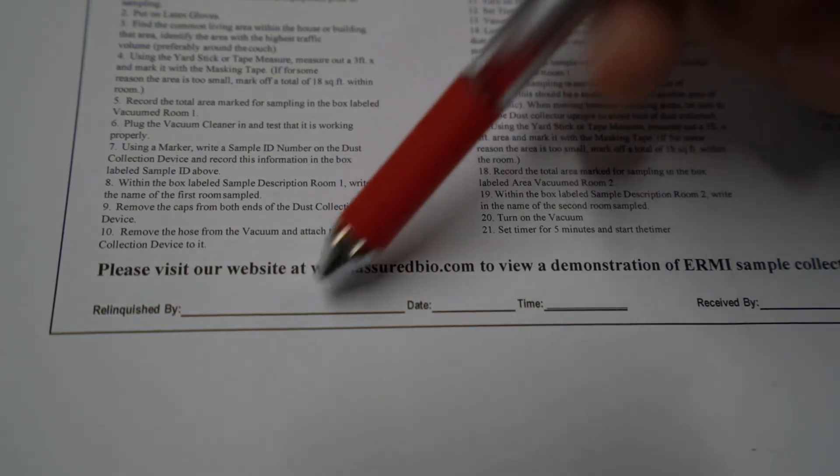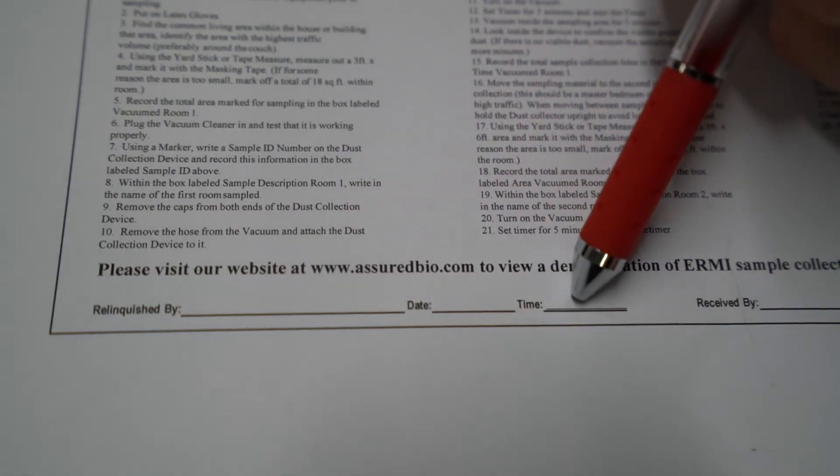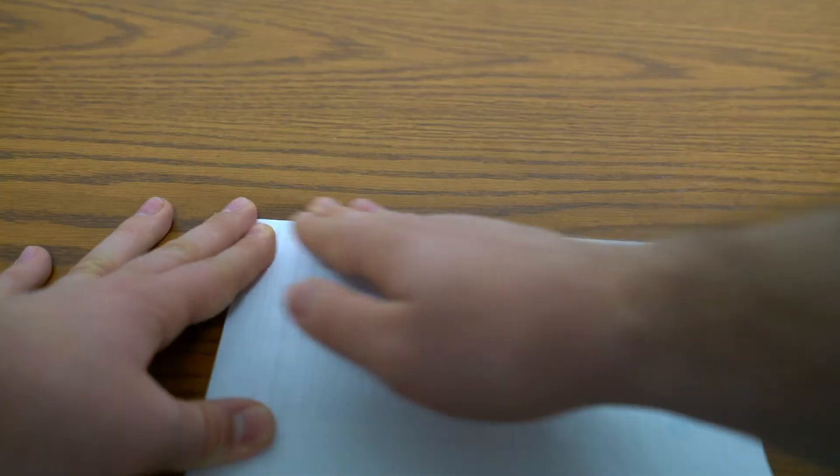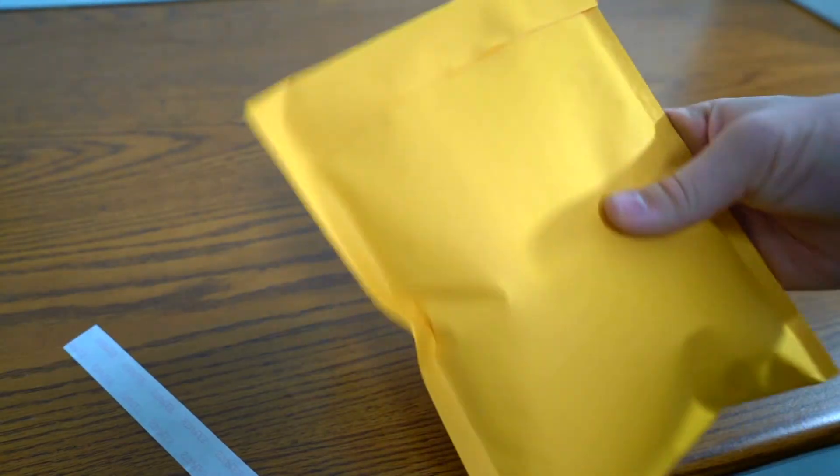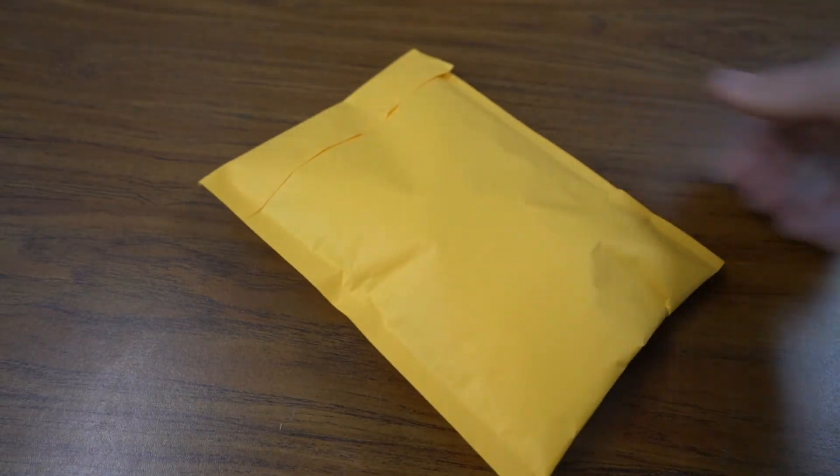At the bottom of the page, you will sign, date, and list the time you sent your sample in. In the end, your form should look like this. You will then place your dust cassette in a ziploc bag, fold up your chain of custody form, and ship it to our lab. Now your sample is ready for testing.